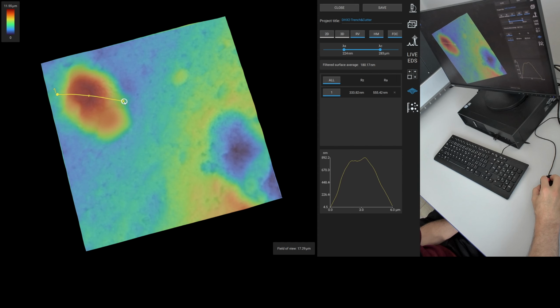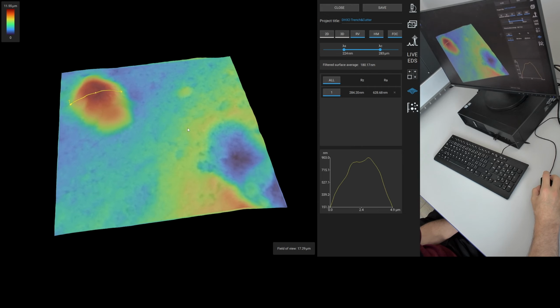Around 5 micron. If you go across there, maybe get the center point here. It's around sort of 5-6 micron. With that, the little apple thing in the middle there. Yeah, basically. Ken Shoulders, you were right.